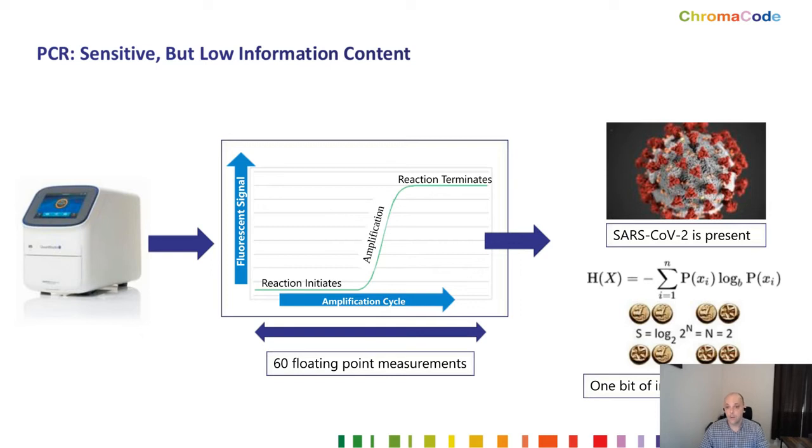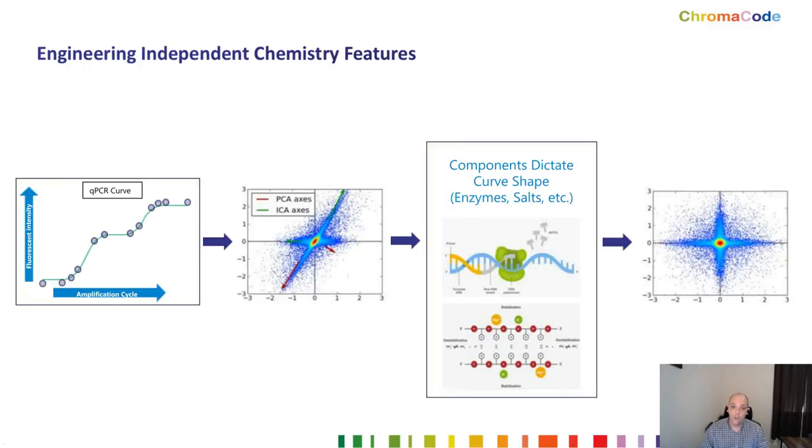What that also means is that you're throwing away most of that data. So as you start engineering the qPCR curve to generate different features for different amplifications, you might have one target that amplifies very early at a very high concentration, and then a second target in the same channel amplify later in a second amplification. What that looks like is two PCR curves stacked on top of each other on the left, and maybe those operate totally independent from each other, and the data works great, and then your assay is going to work out of the box. But sometimes they're correlated with each other.